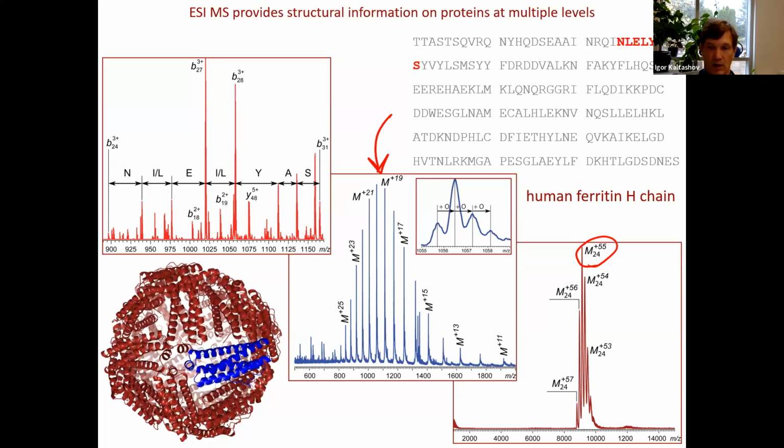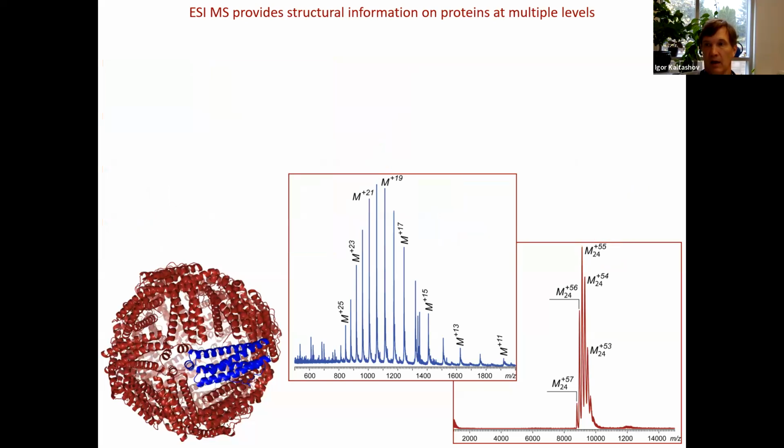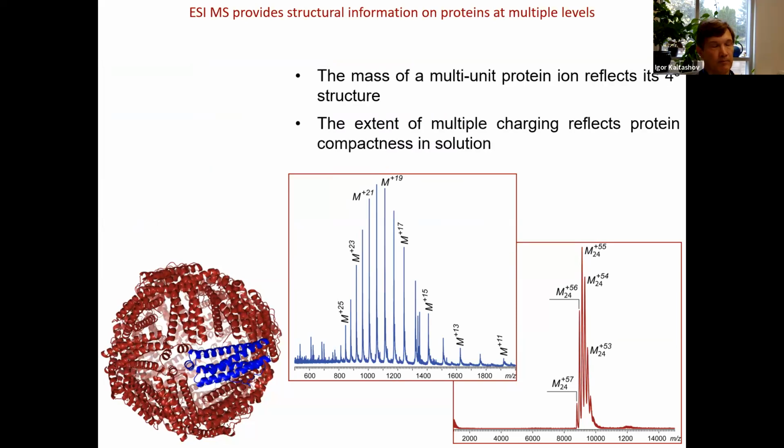And so this is really wonderful news to us, because what it tells us is that you can look at quaternary assembly, pretty large quaternary assembly of proteins, right? And perhaps you can even go beyond that, and you can look at the interaction of different proteins.